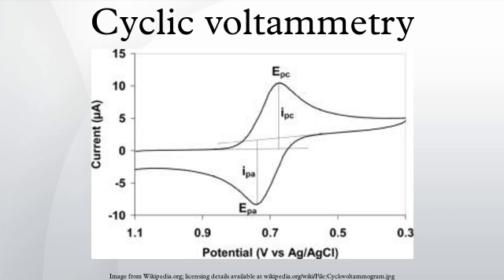Electrolyte: the electrolyte ensures good electrical conductivity and minimizes IR drop, such that the recorded potentials correspond to actual potentials. For aqueous solutions, many electrolytes are available, but typical ones are alkali metal salts of perchlorate and nitrate. In non-aqueous solvents, the range of electrolytes is more limited, and a popular choice is tetrabutylammonium hexafluorophosphate.